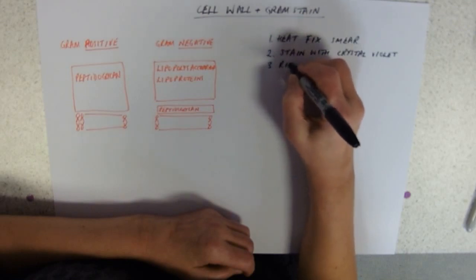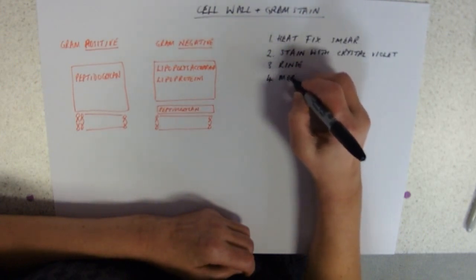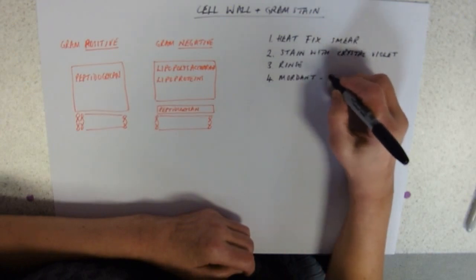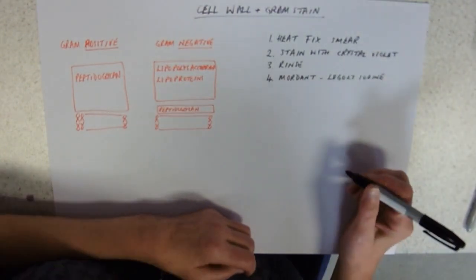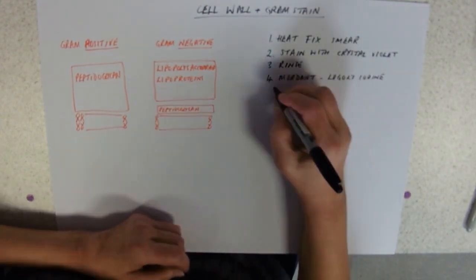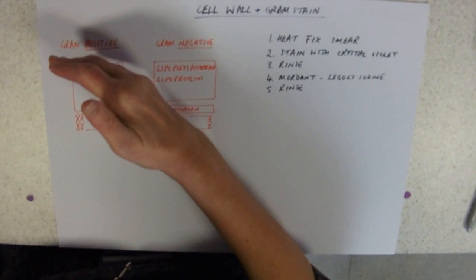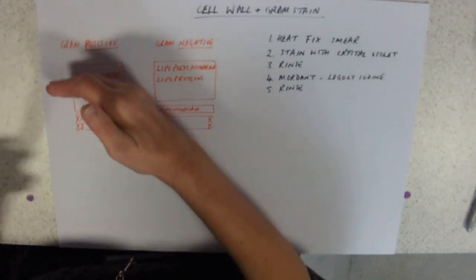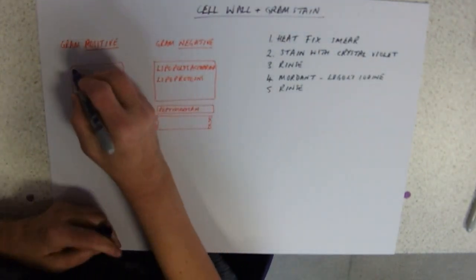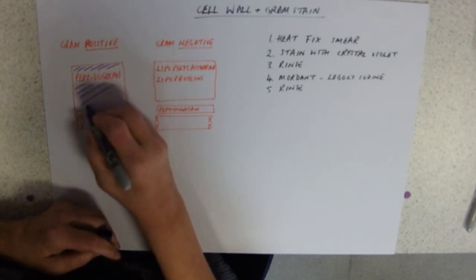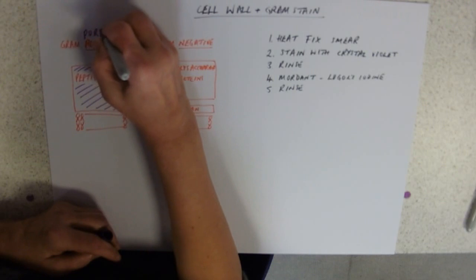Step three: between each step you always rinse with water, and then you'd apply a mordant, which is a sort of fixative, and we use Lugol's iodine for that. You can use Gram's iodine—he invented the stain. Now what happens at that stage, and of course you would rinse it then, is that the stain goes through the peptidoglycan wall, and the mordant fixes it. When you rinse it, if your bacteria is gram positive, it will then appear purple.